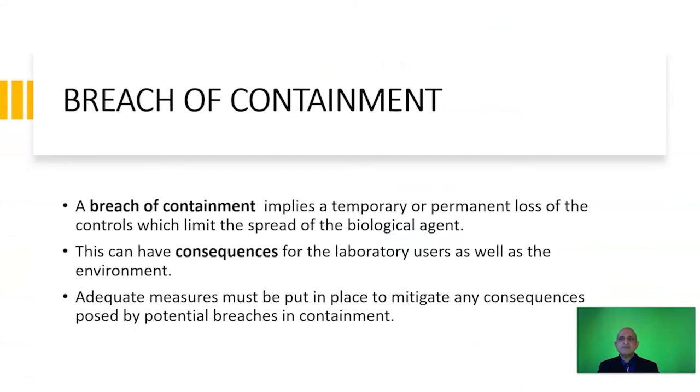The third term which you need to understand is the breach of containment. So a breach of containment implies a temporary or permanent loss of the controls which limit the spread of the biological agent. For instance, if you have a sewage system in your laboratory and you do not manage the sewage system well and there's a leak and the sewage from the laboratory enters into the public drains, there can be a breach of containment.